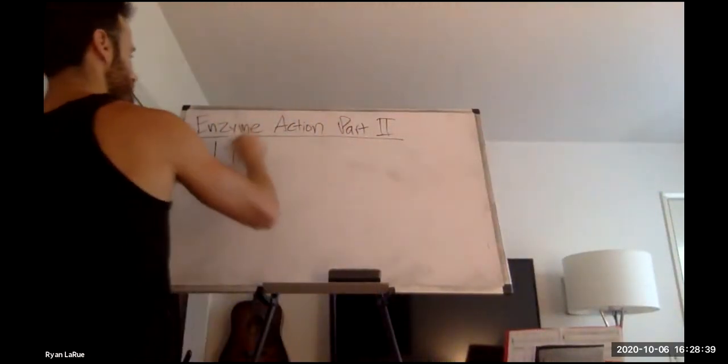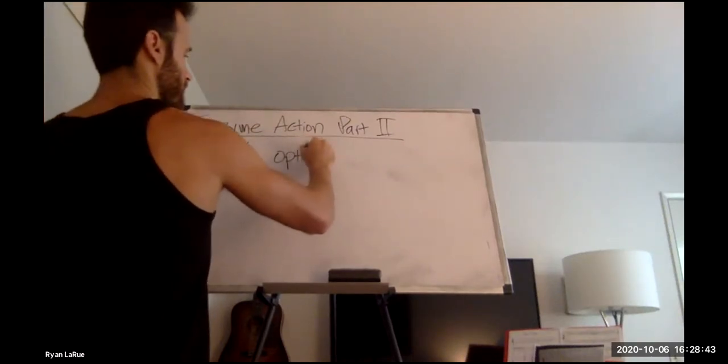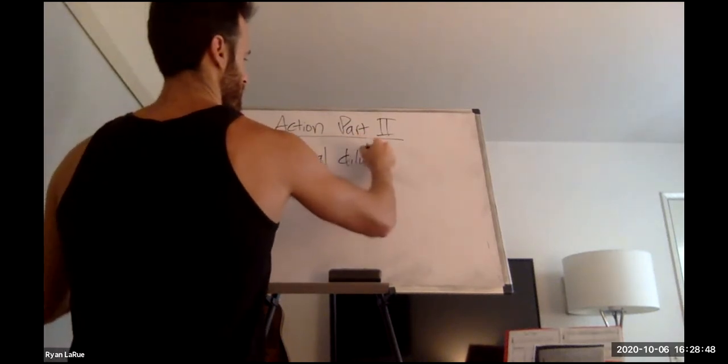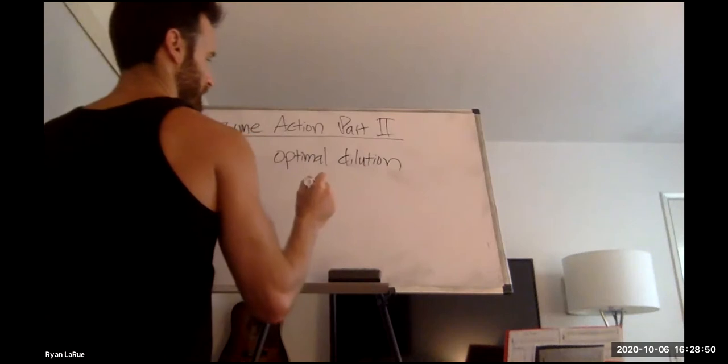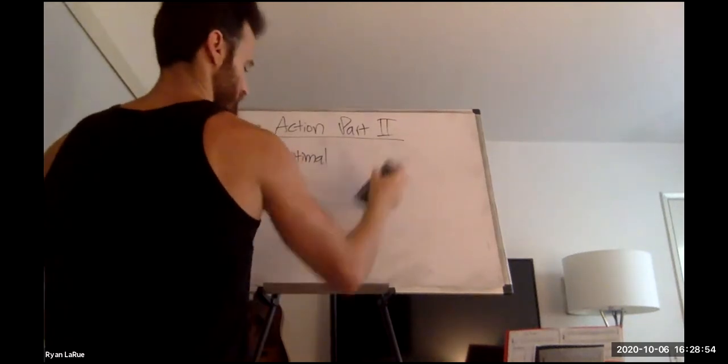Okay. So the 1:16 dilution factor was our optimal saliva dilution from last week. I'll add optimal saliva dilution.